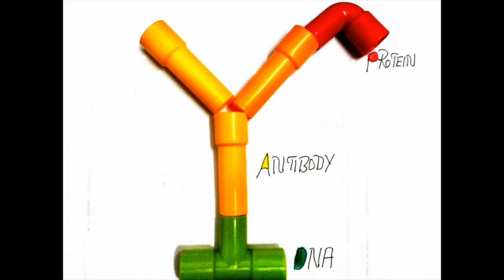Here we can observe the protein antibody DNA complex. That is the immunoprecipitation concept. The protein of interest interacted with an antibody, and we can take out this DNA sequence, amplify the DNA, and after sequencing, we can trace out the DNA protein interaction. This completes the ChIP assay.